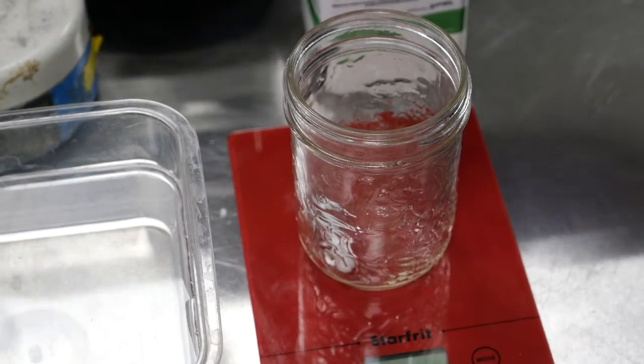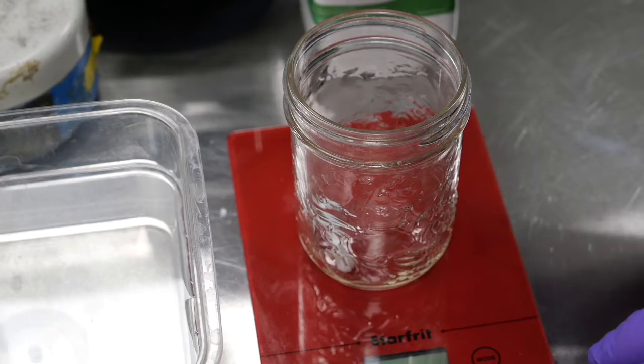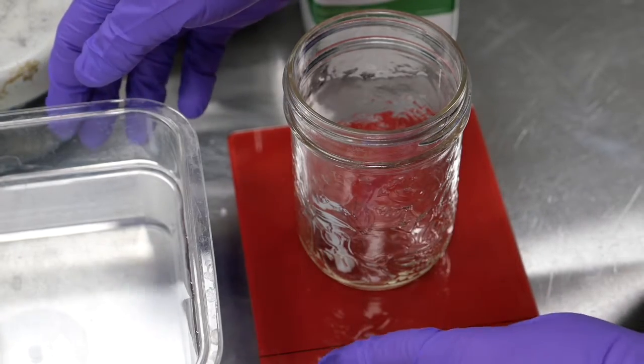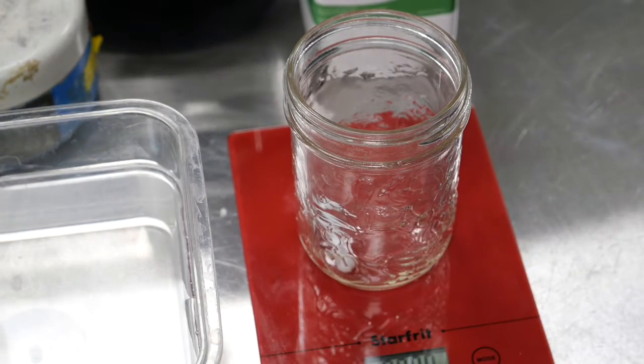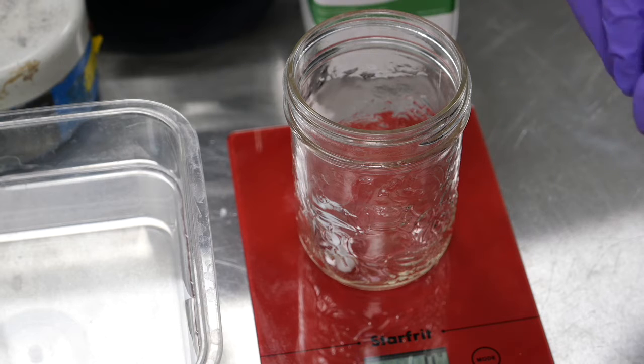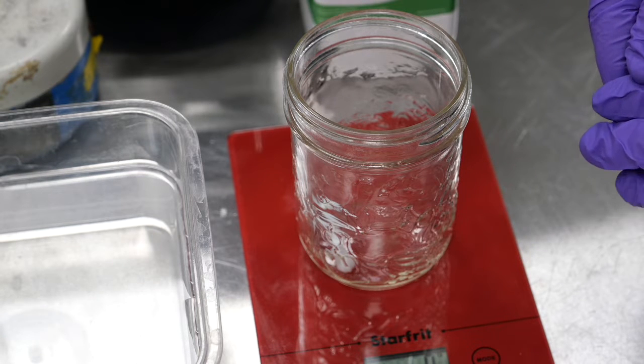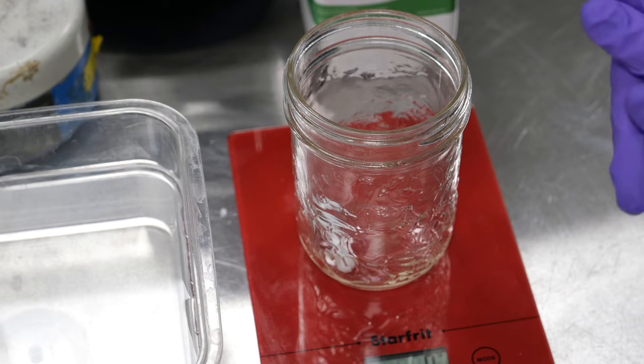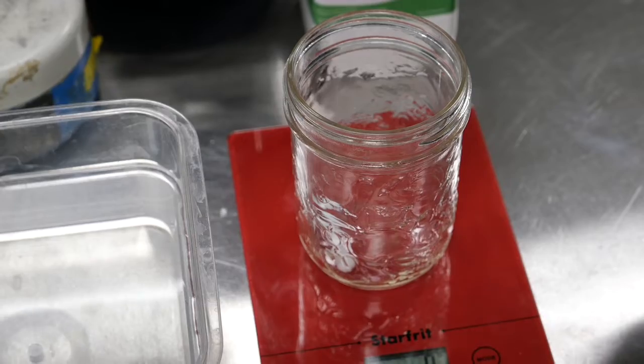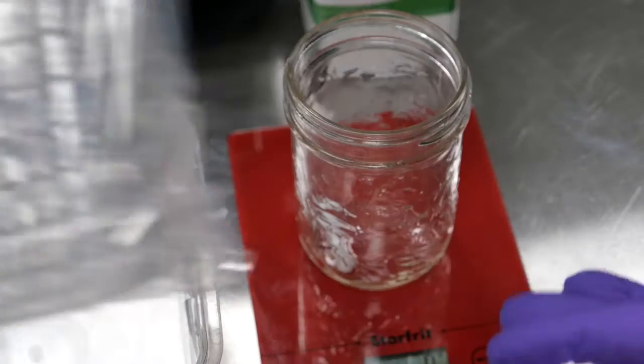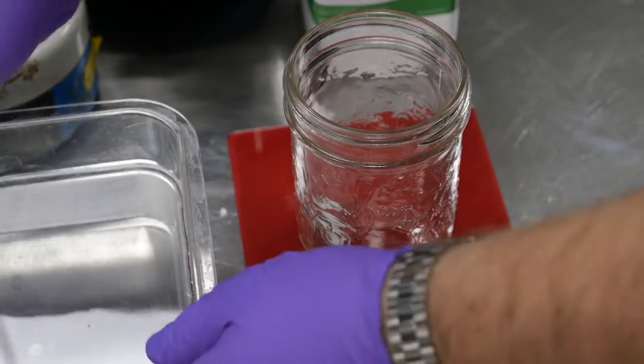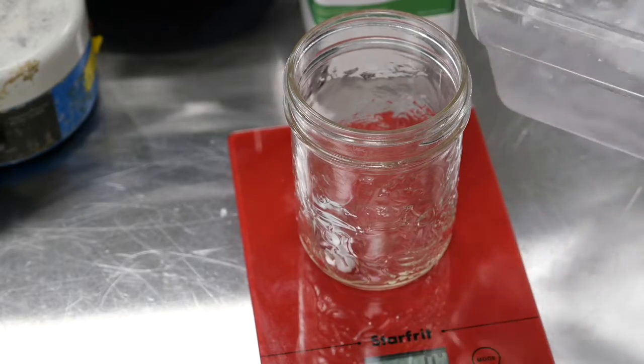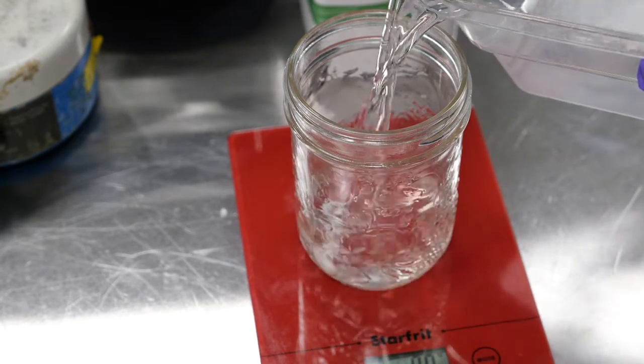We're going to weigh our ingredients, starting with our water. I'm going to do just a quarter batch. A normal batch would be one liter, that'll make about two stacks of plates. I'm going to make about 250 milliliters, that'll give me about half a stack of plates, just enough for what I need this week. So I'm going to weigh out 250 grams of water. It's okay if we're off by a few grams.